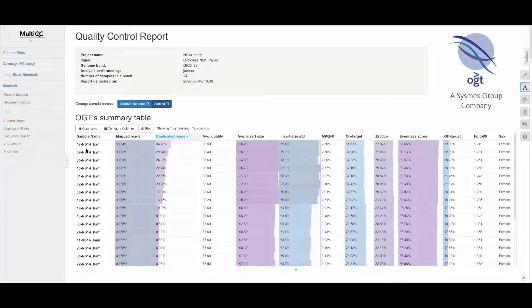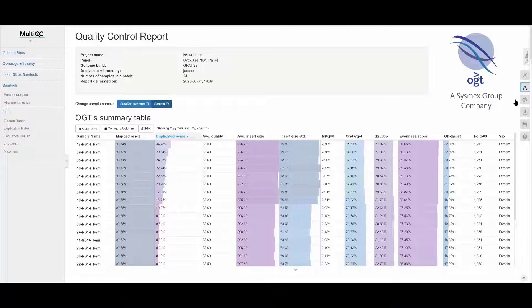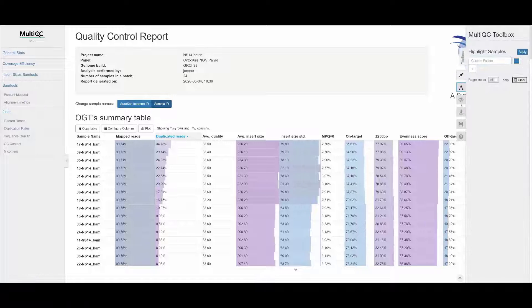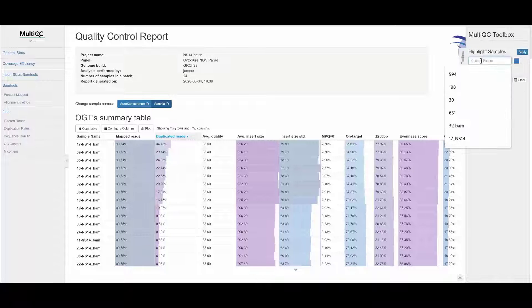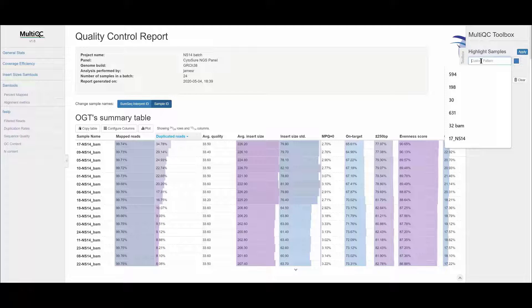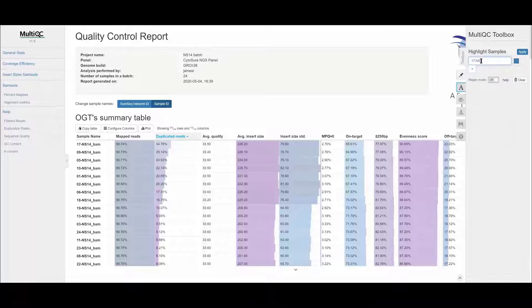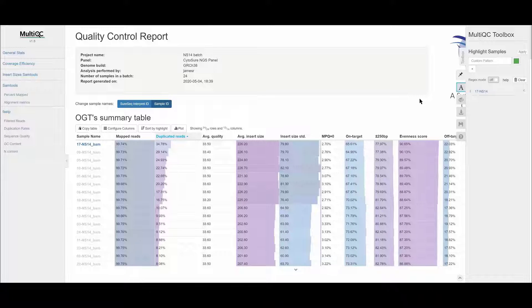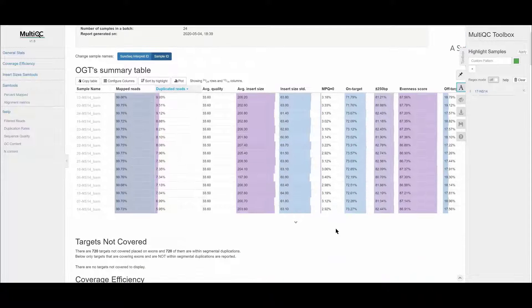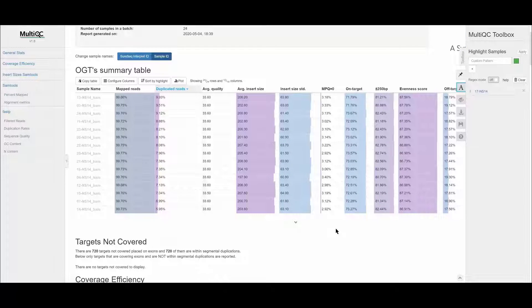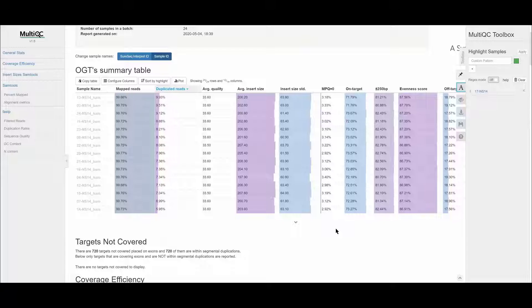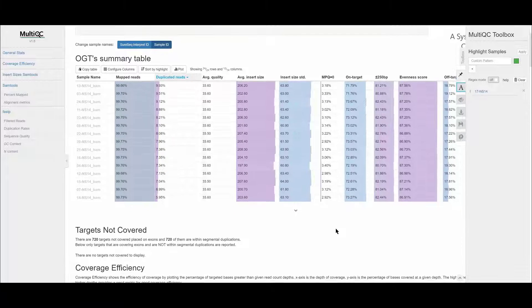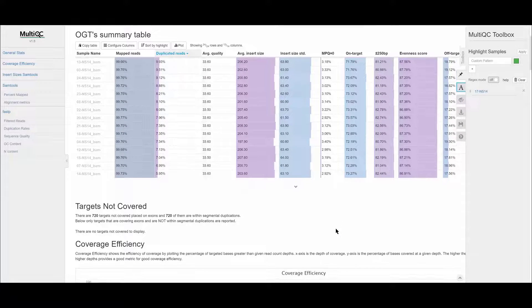One of the features in the toolbox on the right allows you to highlight a sample by entering the sample name and adding it to the list and then clicking Apply. The sample is then shown highlighted in the table as the others are grayed out. This highlighting is applied to the other outputs in the MultiQC report as we can see if we scroll down.